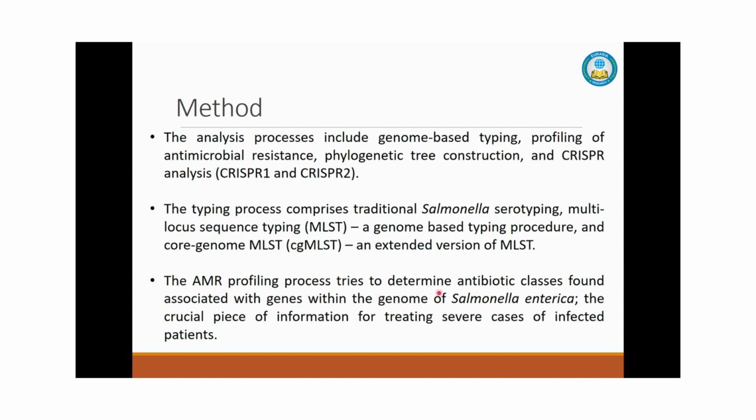This tool can determine the antibiotic classes associated with genes in the genome of Salmonella enterica. This is crucial information for professionals to treat patients with the correct antibiotic drugs.